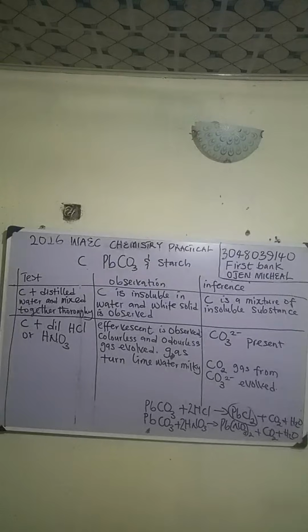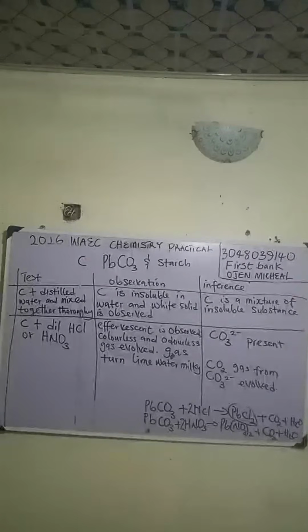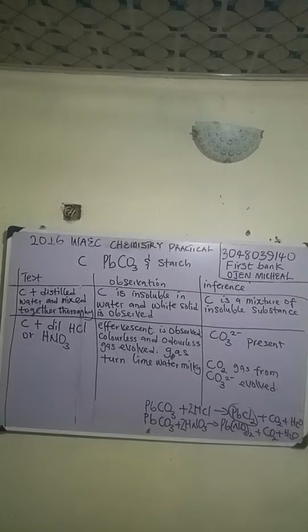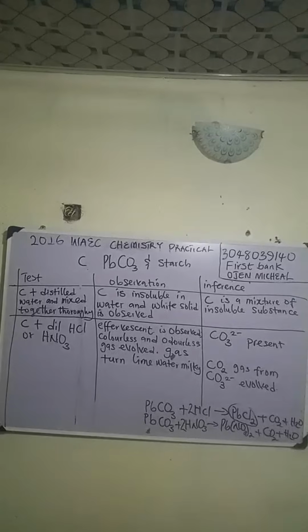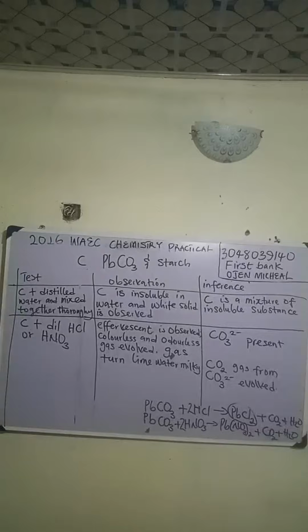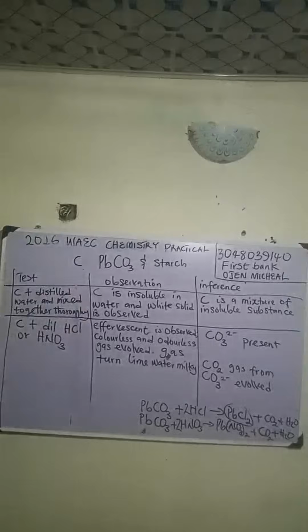No, you are going to watch this one, okay? How do you get CO2 gas? Yes, you are going to add that HCl. I will respond to that. Now, let me come again.